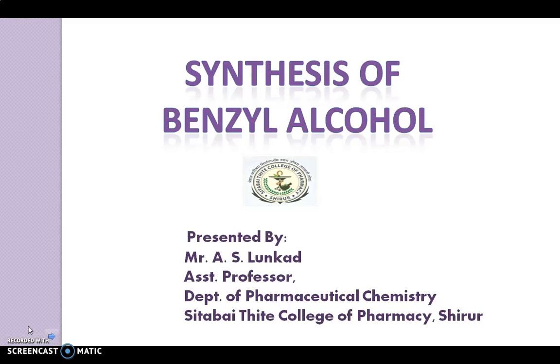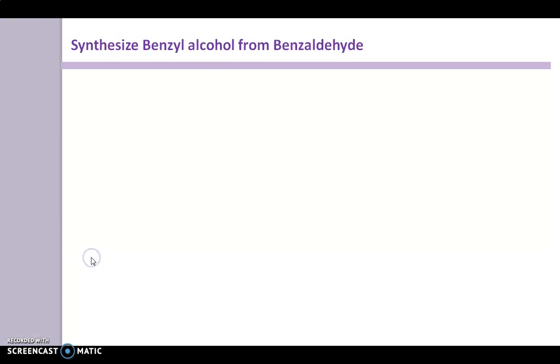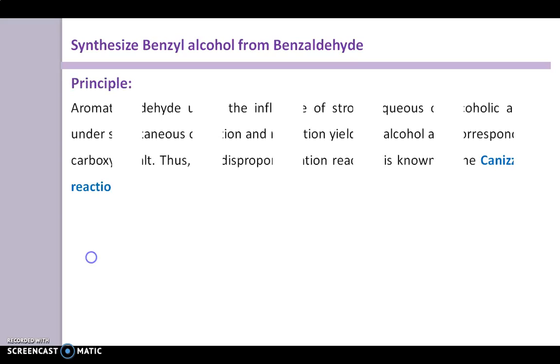Here we discuss the synthesis of benzyl alcohol. The synthesis of benzyl alcohol from benzaldehyde involves a Cannizzaro's reaction. So let's begin with this. Synthesis of benzyl alcohol from benzaldehyde involves a basic principle.